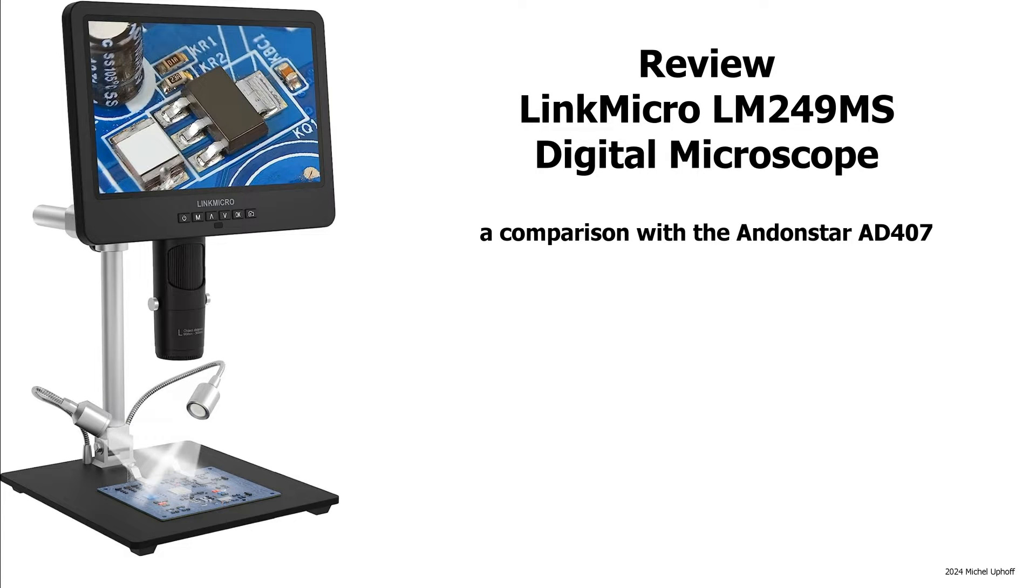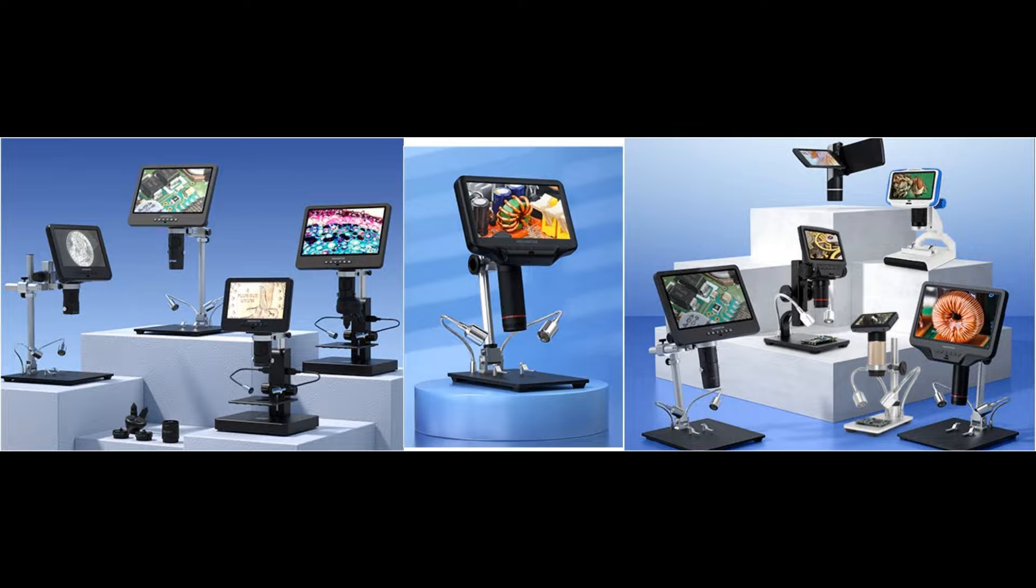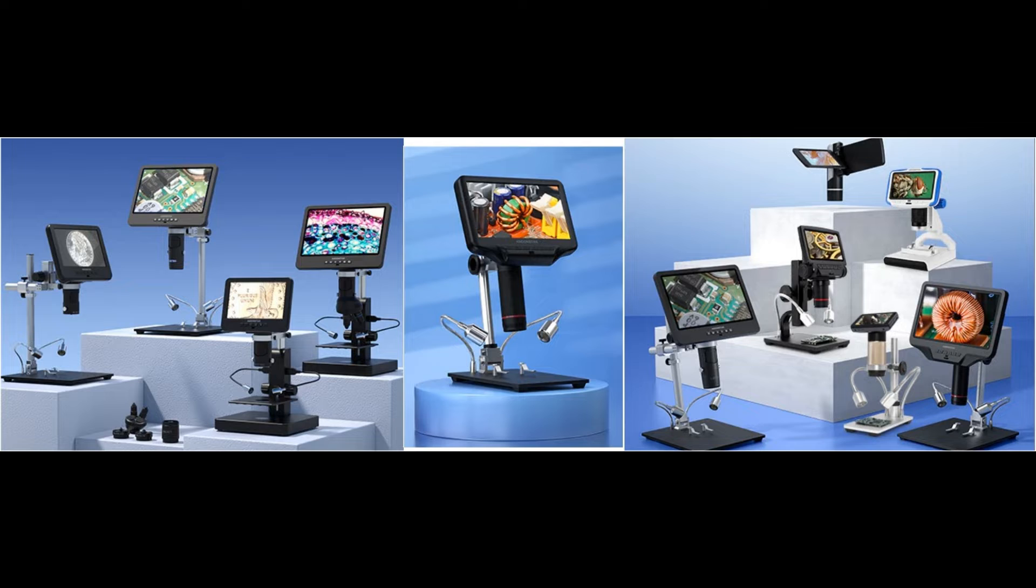Link Micro asked me if I would like to review their LM249MS digital microscope. I agreed on the condition that I could write anything I thought necessary. This microscope is actually made by Shenzhen Andonstar Technology, which produces many more variants.